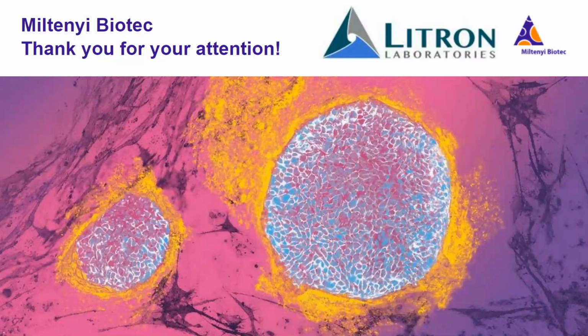Sure. I mentioned it again right towards the end of my presentation. I think I said rodent studies. We have kits and services specific for rat. That's probably the most common test system that we work in. And there's a slight antibody change to go over to mouse. So we can support both of those very common laboratory-based species.